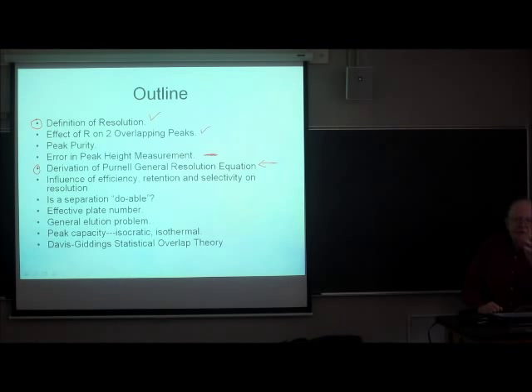If there's enough retention, giving the system more retention doesn't really benefit you very much. So you need to know what the nature of the problem is before you solve the problem. And these are the three factors I just mentioned. Plate count, or we also call it efficiency, the retention, measured by the retention factor, and the selectivity, or band spacing, all have different effects on the resolution.